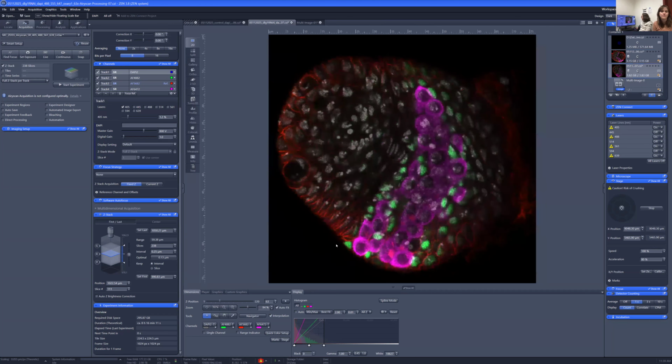And so that's the big picture goal of these experiments, to understand what genes control the number of egg stem cells. And so today we're going to be doing some imaging of some new samples that I've been working on this week.